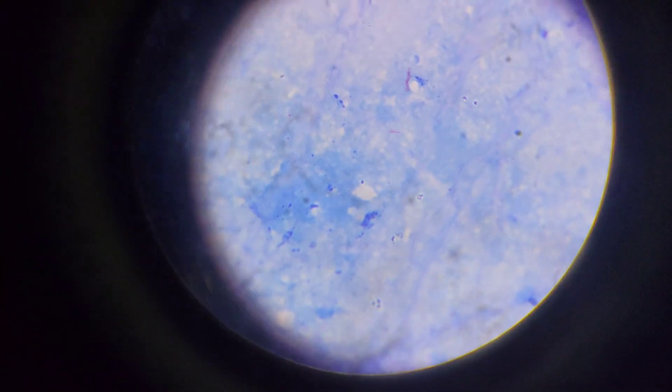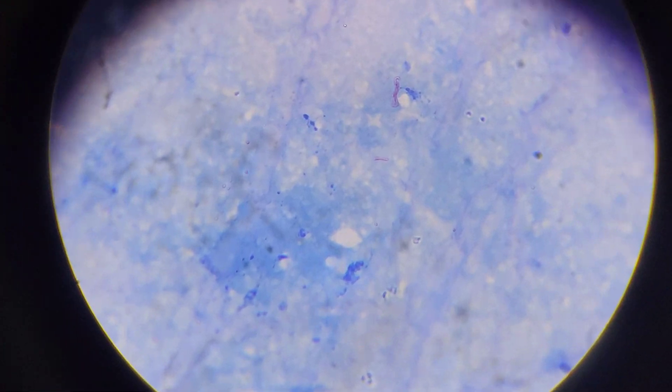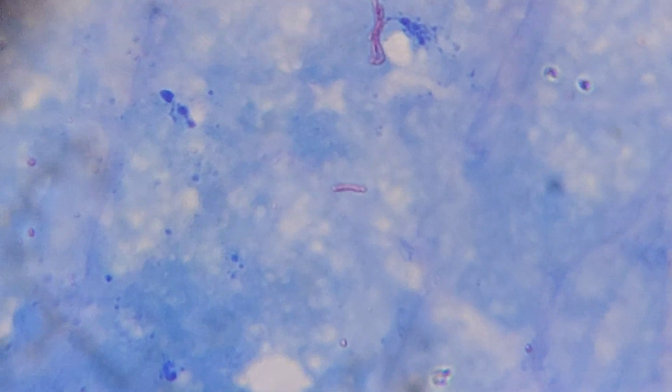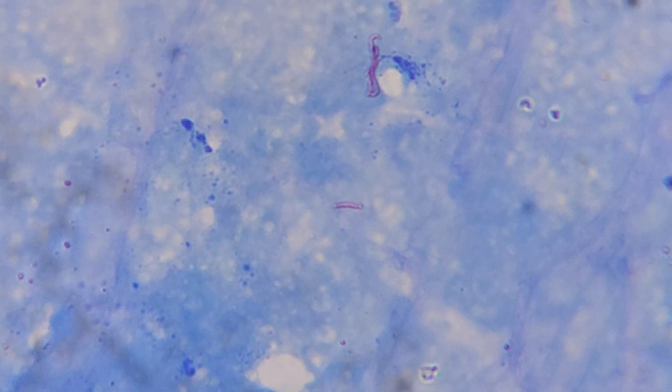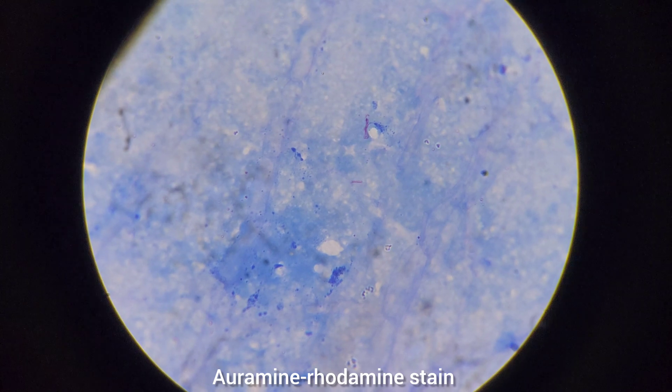Safety precautions like gloves, masks, PPE should be taken during Ziehl staining. Contaminated materials or used slides should be discarded in a jar containing 5% phenol. The alternative to Ziehl staining in TB control programs: we can use fluorescence microscopy using auramine-rhodamine stain.